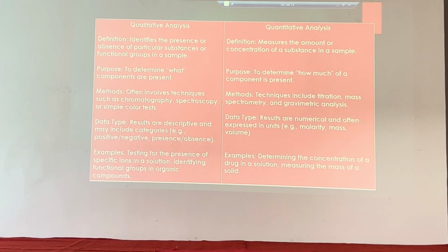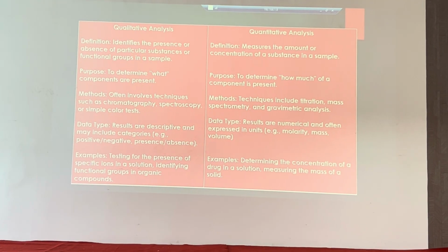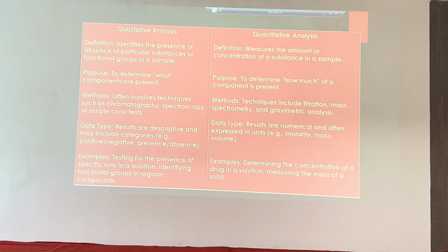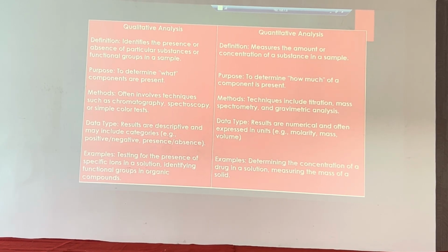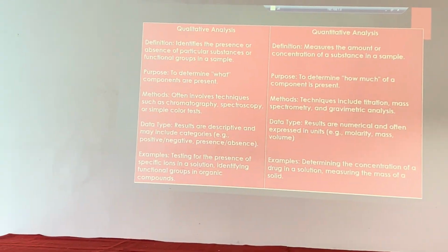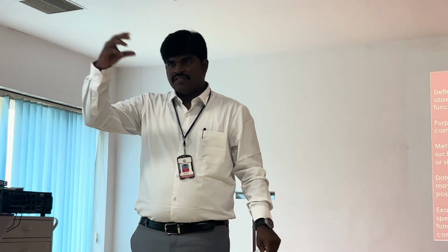Take a microbiology example. If Salmonella is present or absent, you inoculate the product, and if growth is observed as positive, whether E. coli or Salmonella, if it is present we can confirm that there is a microorganism in it. In a similar way, in an identification test, if you mix some XYZ compound with the XYZ solvent and it produces a reddish brown color, or shows effervescence and fumes, we can easily identify whether it was present or absent.